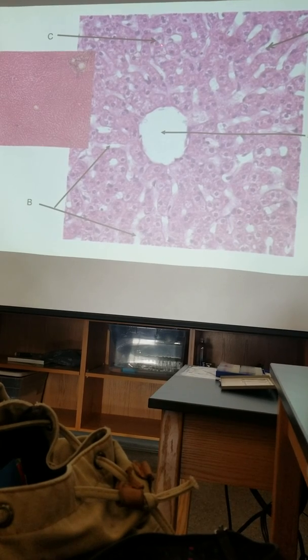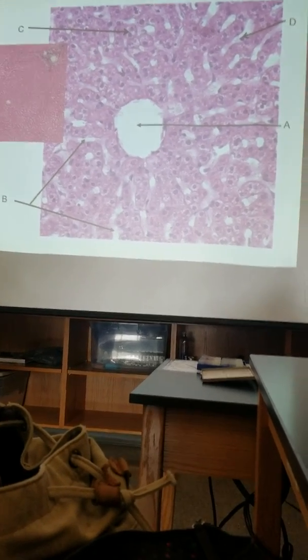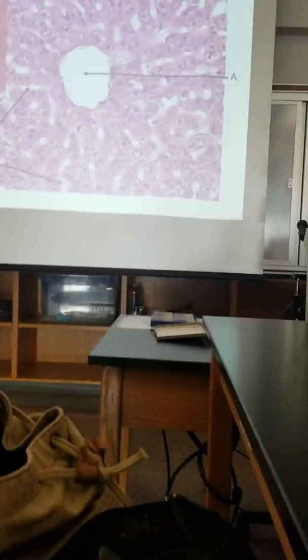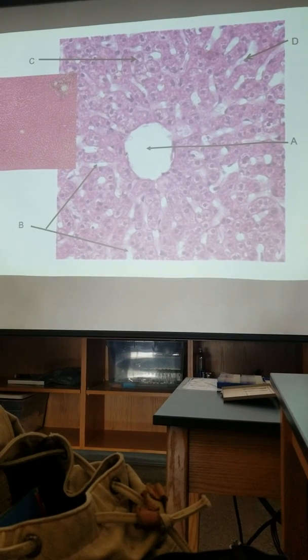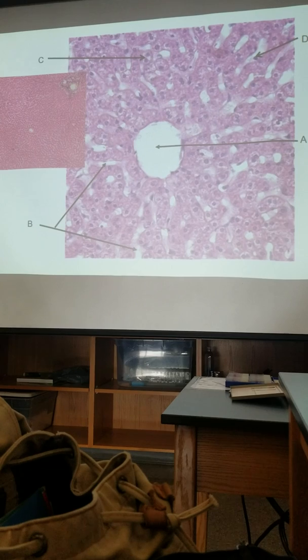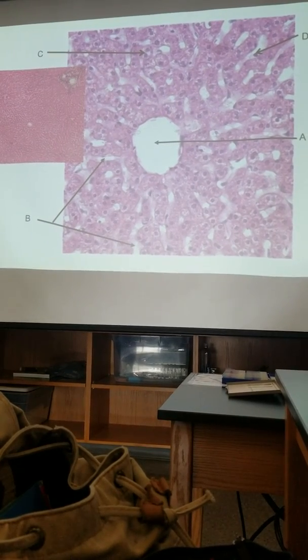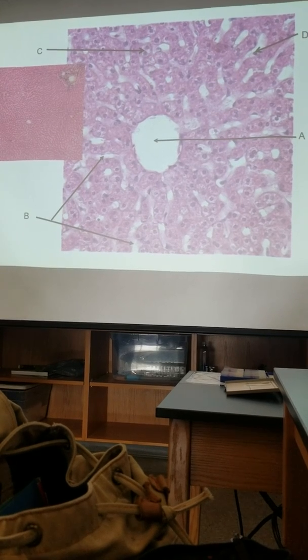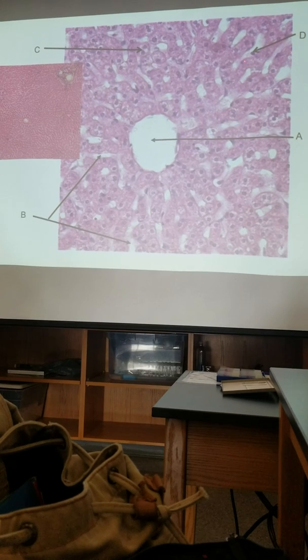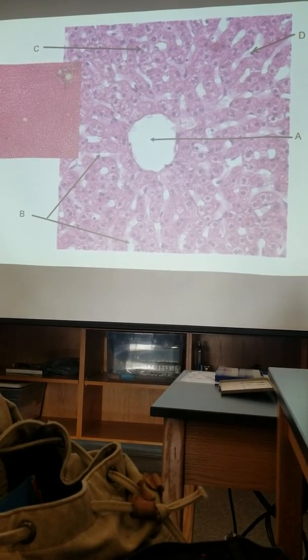And then the parenchymal cell, hepatocyte. Remember, hepatocytes can frequently be binuclear. And if you look at this image and look around a little bit, you'll see quite a few cells that are binuclear. This being one of them, this one being another one, this is another one. So there's quite a few binuclear cells among hepatocytes.